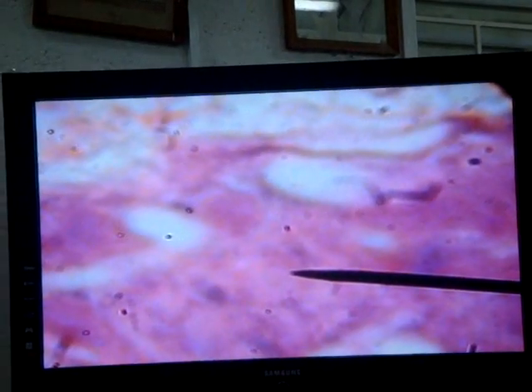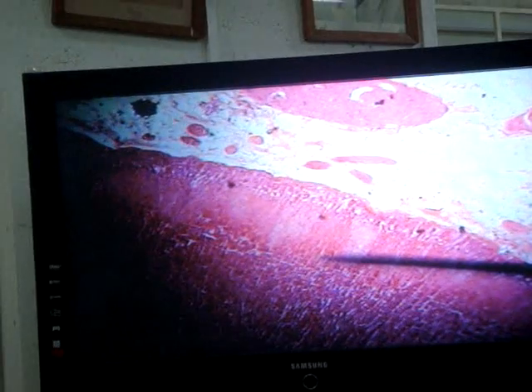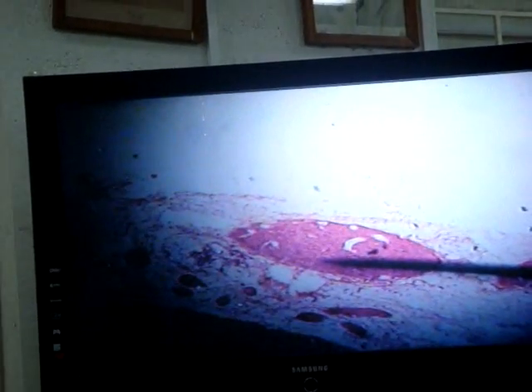Now, topographically speaking, we could encounter several things outside of the capsule of the adrenal gland. One of them is on this slide. I have observed this structure here outside of the capsule. Sometimes we could give you a panoramic view, so you can see the adrenal, and I will ask you to identify the structure just to the left of the field. That would be this structure here.